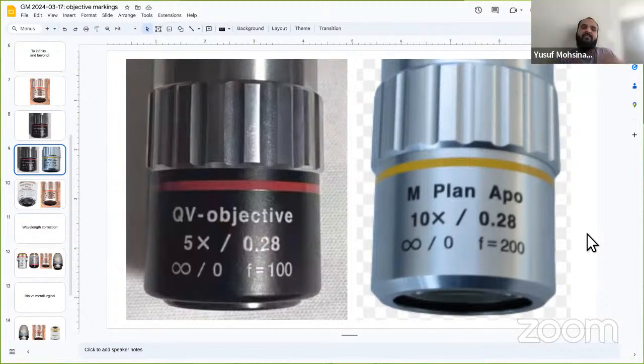Okay. So I guess a good comparison is between optical magnification and digital magnification on your cell phone camera. Yes, that's exactly it. With digital magnification, maybe it can extrapolate a little bit, make it a little bit bigger, but you're not going to get more information. It may make it a little bit easier to see, but it won't fundamentally change the data that's coming out. So sounds good.